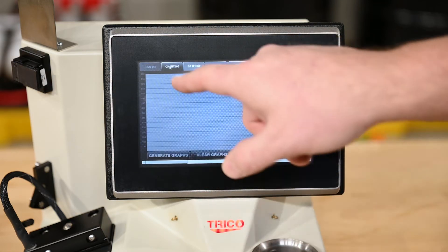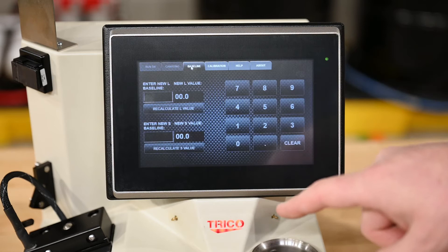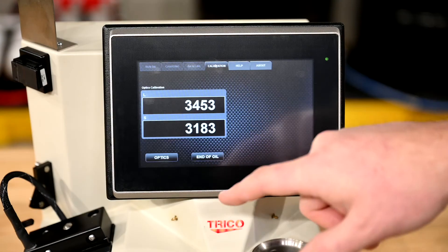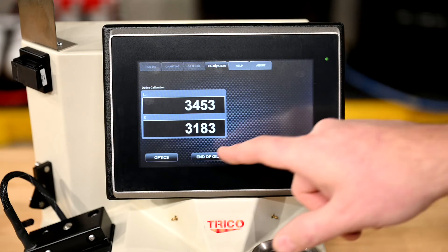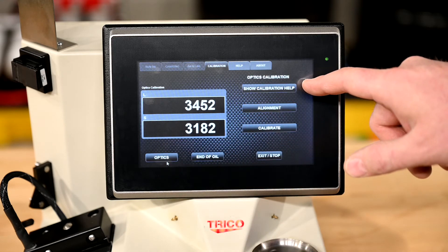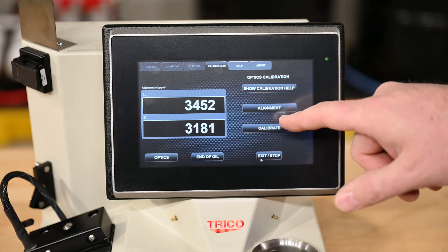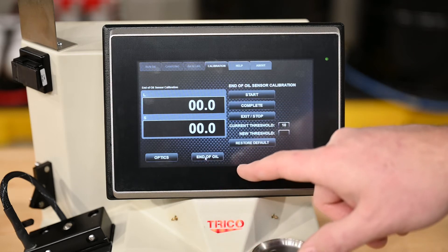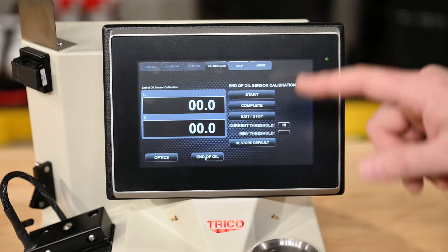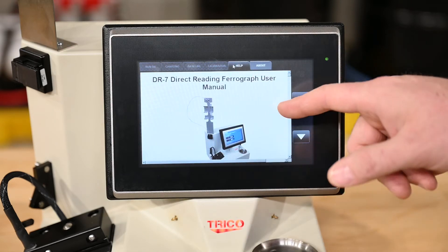The next option is the charting option, which will generate graphs of your DL and DS numbers. The next one is for calibration purposes on the baseline if you need to adjust your baseline. Next is the calibration tab where you have options to adjust the optics, including calibration help which directs you to the manual, alignment to align the machine, or calibrate to calibrate the machine. Next is the end of oil sensor, which adjusts the threshold where it reads your meniscus when it tells the unit it's complete. The help tab is a copy of the DR7 instruction manual.